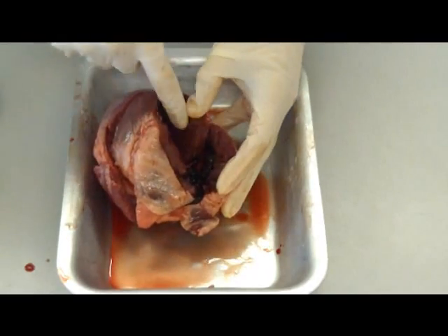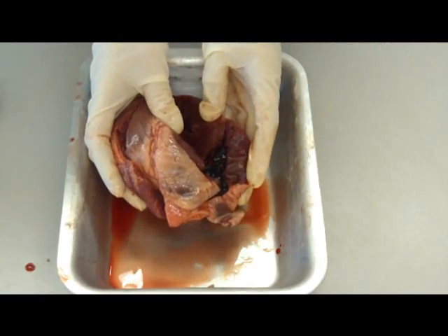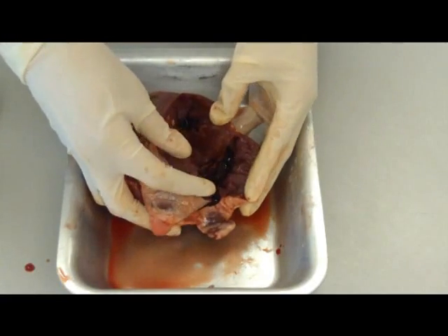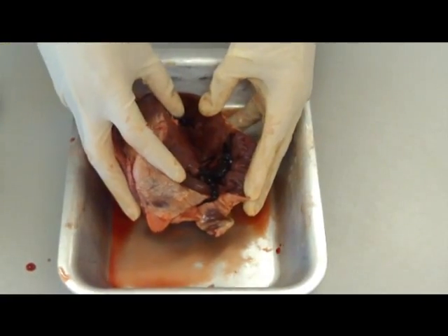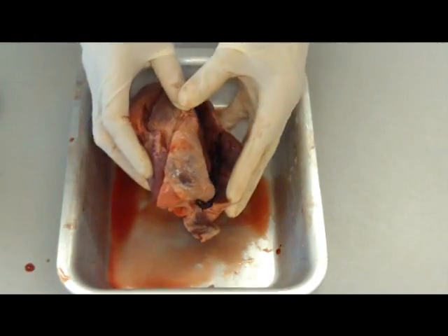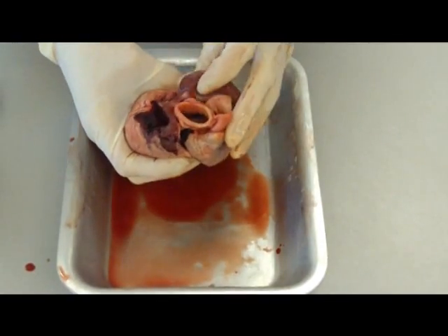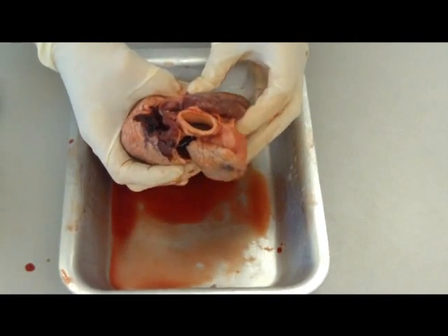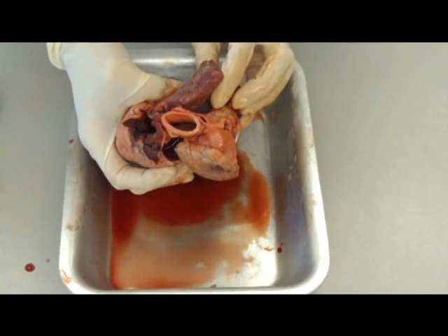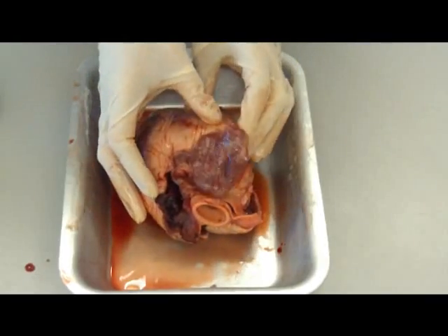The bottom chamber, the ventricle, the walls are much more muscular because they actually have to pump it around the whole body. Your atriums are at the top and your ventricles are at the bottom. At the top here, you've got some arteries - that's obviously your aorta. And then the one we cut open was the vena cava, which is the one that supplies blood to the heart that's actually been around the body and all the oxygen has been used up.